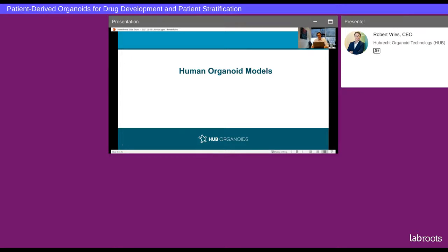So what I wanted to show you is that with this we have developed different models, and also what is an important aspect at the moment, as already discussed, on the one hand we have this clinical validation. On the other hand, I showed you this initial organoid, this sort of 3D cystic structure that represents the epithelium. That is the basics, the first type of organoid that we can use especially for viability screening, drug screening, as I showed you. However, for certain other diseases or interaction with the immune system, we need to develop new organoid models that have other ways of representing the epithelial barrier, and those are the examples that I want to show you today.